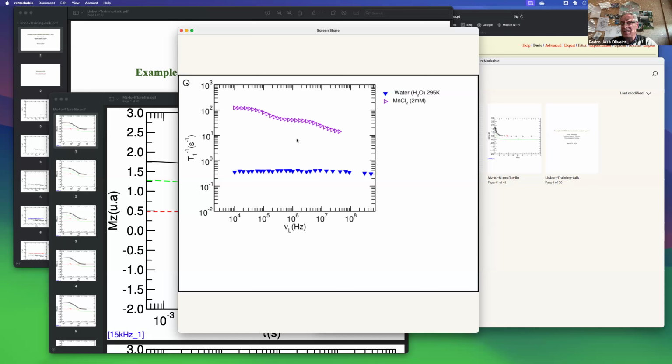As you can see in this frame of reference, a plot that goes from 0.01 to 1,000, and from something like 2 kilohertz to maybe 900 megahertz, within this observation area we see all the profiles coming inside, and they show features that are more or less common to each other.